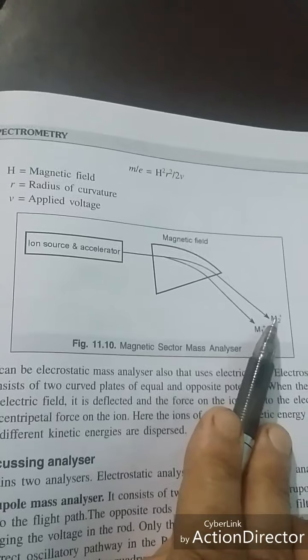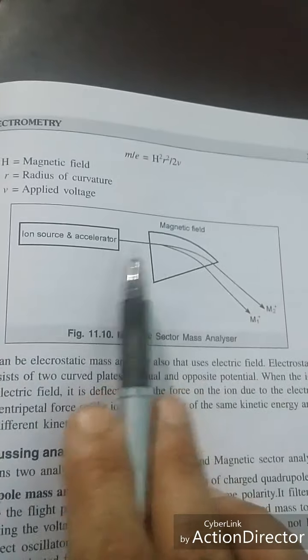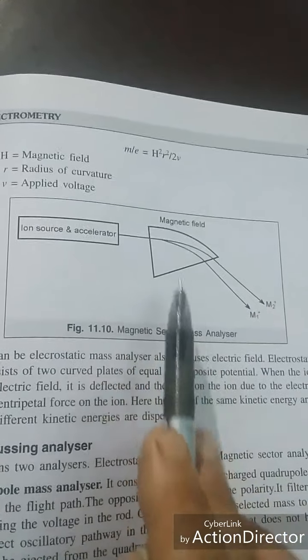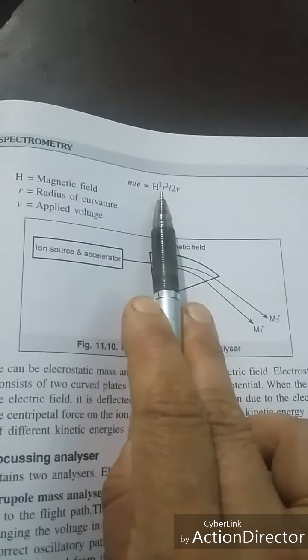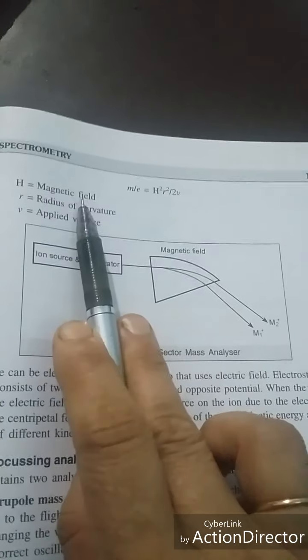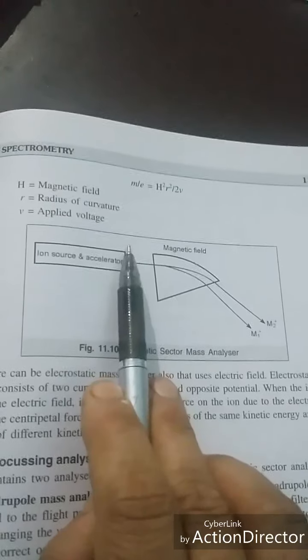Ions in the magnetic field experience two types of forces. First is the force due to the magnetic field, and second is the centripetal force. So m/e is given by H²R²/2V, where H is the magnetic field, R is the radius of curvature, and V is the applied potential.